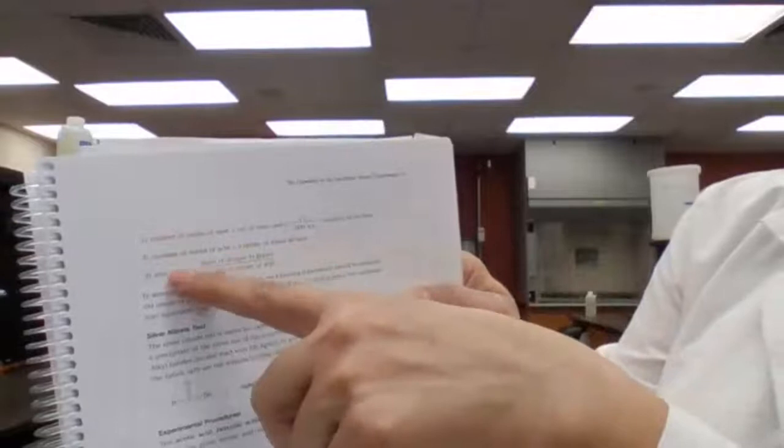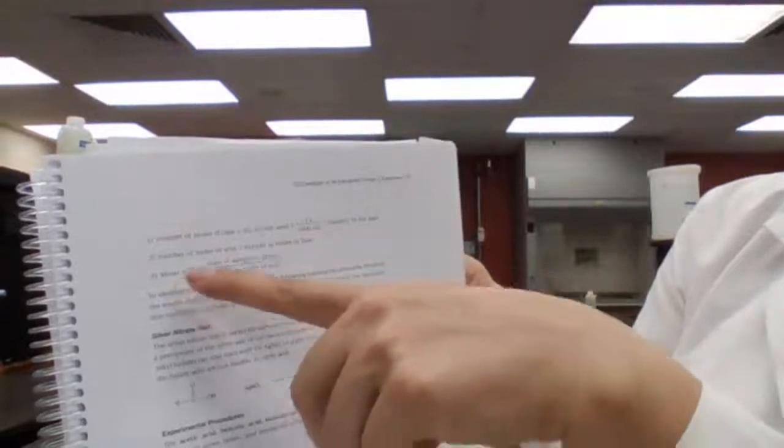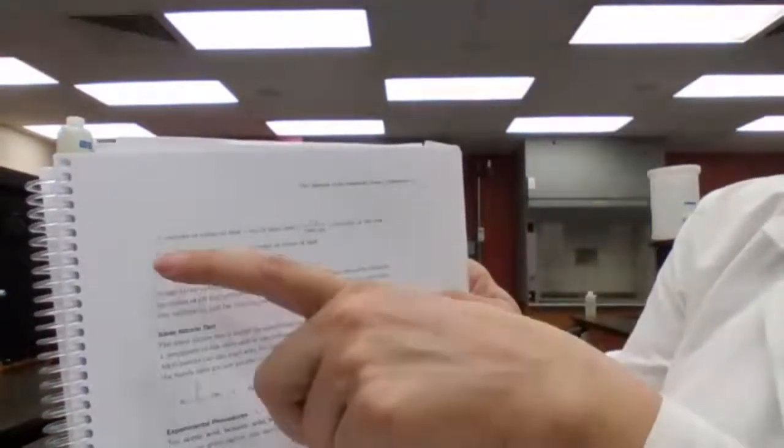And if you have the moles of the acid and you have mass of the acid, you can calculate the molar mass. So basically, mass of the acid divided by number of moles will give you the molar mass for your acid. And based on the molar mass, you can find out which acid you are dealing with.